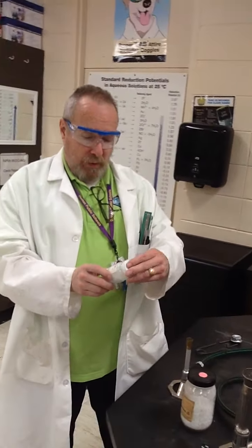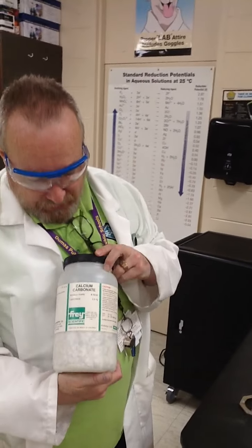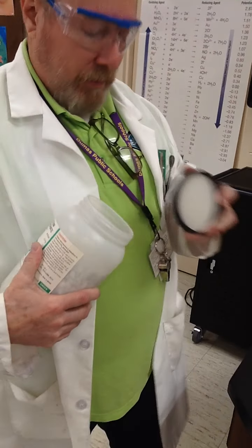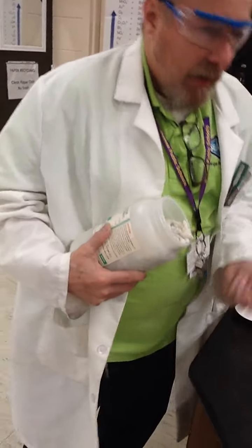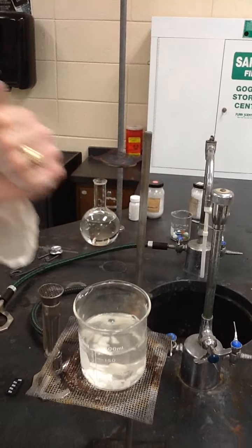Here's a new small one, marble chips, also labeled limestone, also labeled calcium carbonate. Here's one from Frey Scientific, labeled calcium carbonate, but in fine print underneath, it's marble chips. You take a few chips out, like so, and you drop them into your beaker.